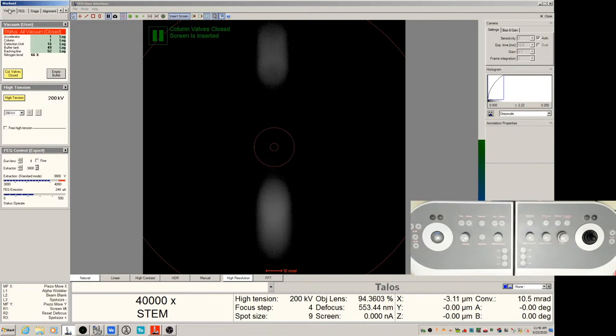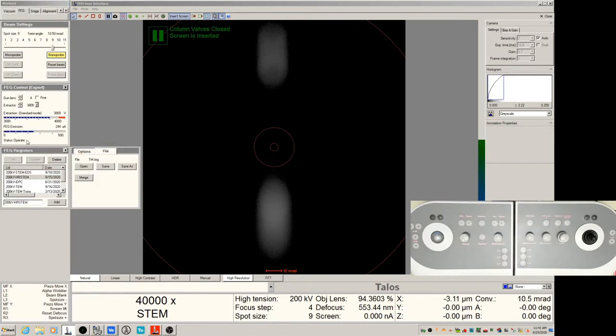So to start with TEM, let's go to this FEG tab and come to here, say the FEG registers. So FEG registers mean just alignment settings. They can be saved as files. For example, if you click this little triangle in the flap out, you will see the file name we are reading is the tm.feg. So that's the alignment file I am maintaining. Every time when I use this microscope, I'm gonna update these items and save in this file.